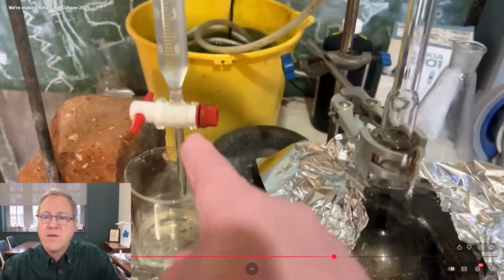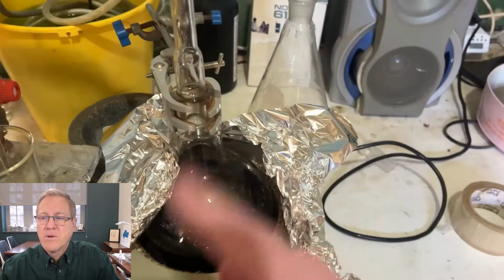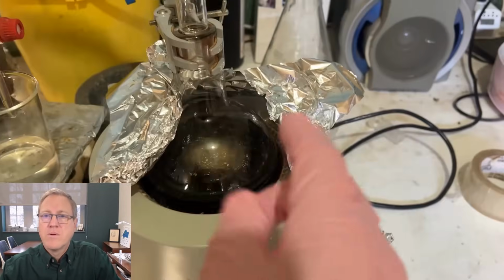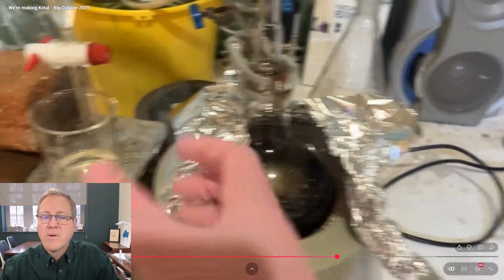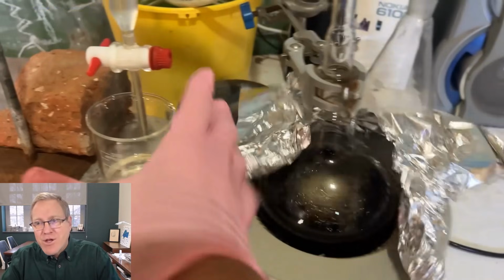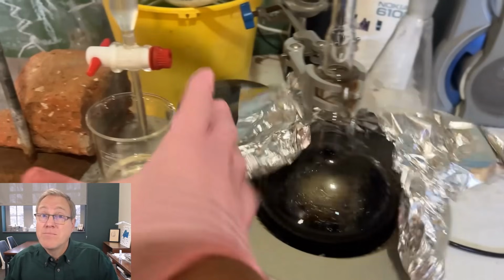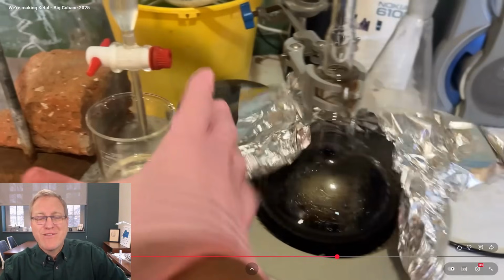Floats down here, and then we tap it off. And the toluene at the top here just floats back. Any water that's created in this reaction, we instantly drive off and collect, and that drives the reaction forward because we're continually sucking water out of that reaction. So continuously sucking water out and driving the reaction to completion by Le Chatelier's principle. If there's nothing else you remember from this, Le Chatelier's principle. It's just a fundamental idea in chemistry.